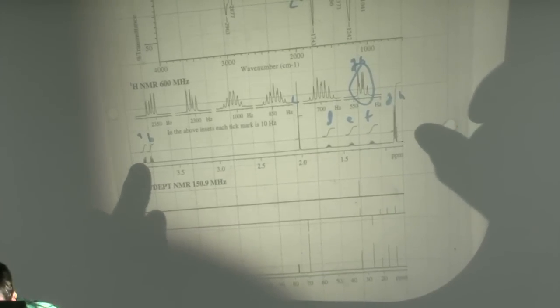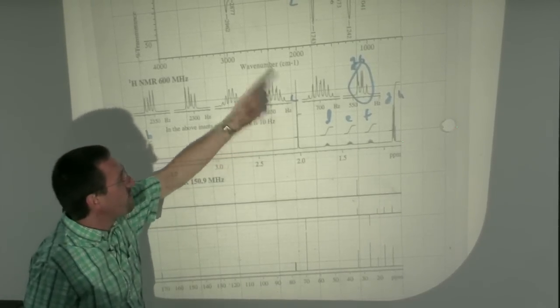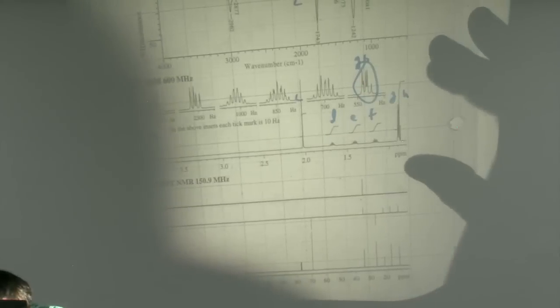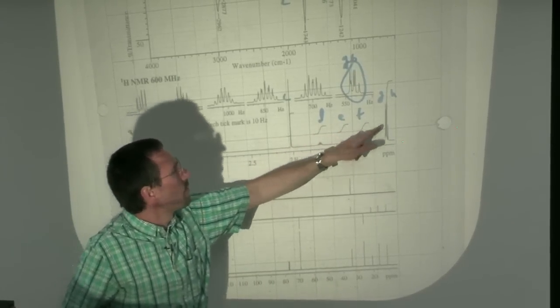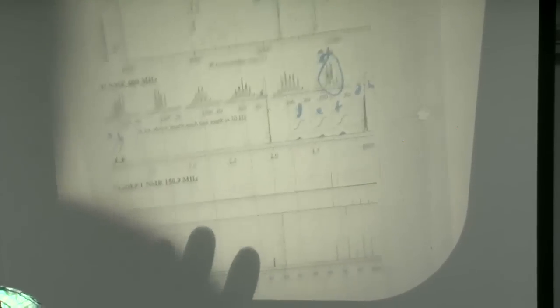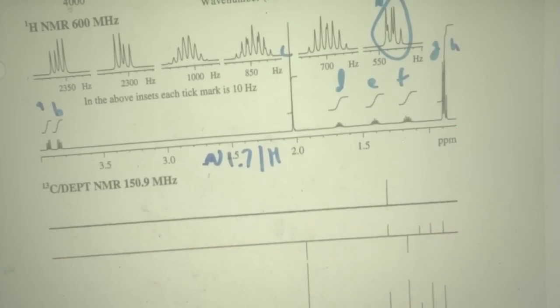If I'm really feeling lazy, I could always just use my grid as some sort of uber ruler, and say, oh, 1.7, 1.7, 5.3, 5.4, yeah, 5.4, 1.7 or 1.8. If I want to be good about it, I will even try to line up my grid a little bit better. Yeah, about 1.7, 1.7, 1.7, about 10.6. If I work this out, I'm getting about 1.7 per hydrogen. This ruler, by the way, is graduated in tenths of an inch, the small tick marks on there, in case you're wondering.